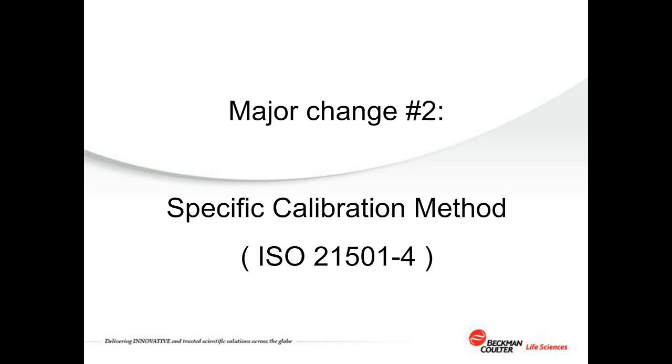Also, it references ISO 14644-1, and that calls for the need to make sure your instruments fit the ISO 21501-4 calibration. A lot of older instruments would not necessarily be able to be calibrated to that, and if an instrument is not in good repair, it might also fail this calibration method.